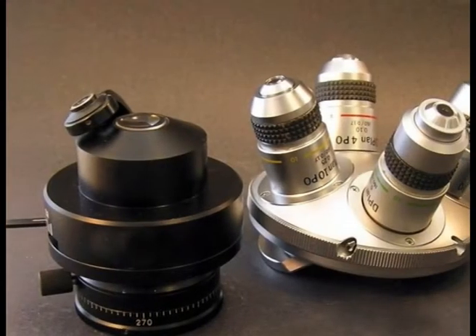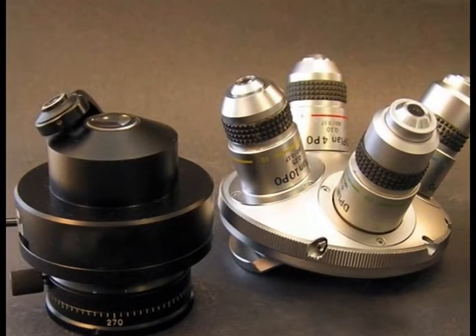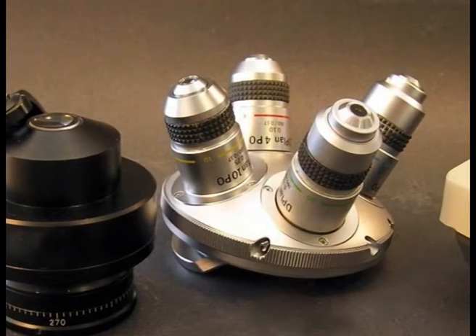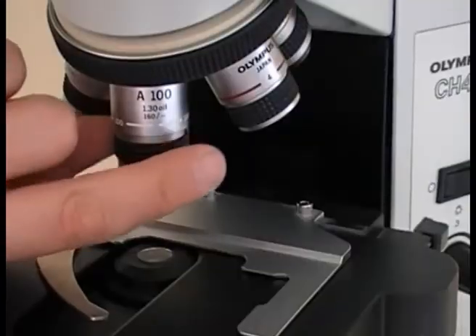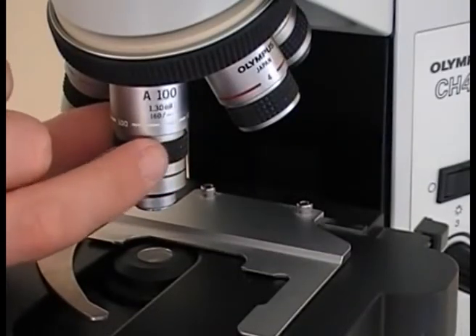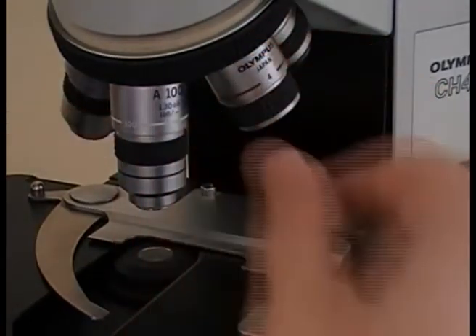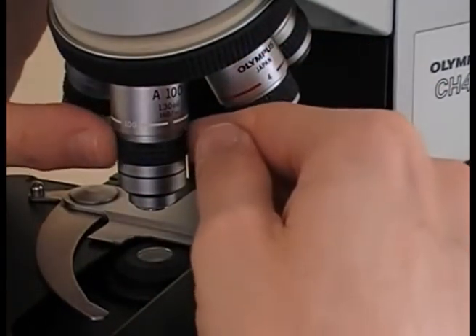Modern types of microscopes are provided with a revolving nose piece system or objective clutch system for mounting the objective. Usually, the microscopes with inclined tubes have a multiple lens nose piece that allows objectives to be interchanged simply by rotating the nose piece. In vertical tube microscopes, the objectives normally screw into the centering ring or collar, held against the microscope tube by a spring clutch arm.